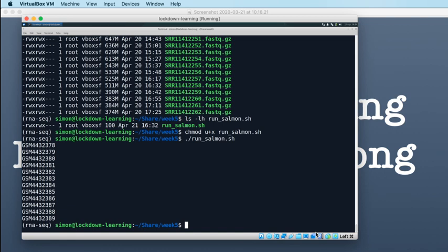And we're going to build it step by step. So the first thing that we're going to do is use our old friend grep, which might have been a while since we've written any grep, but grep you can use to find the matching lines for any given input pattern. So I'll just show you an example here.